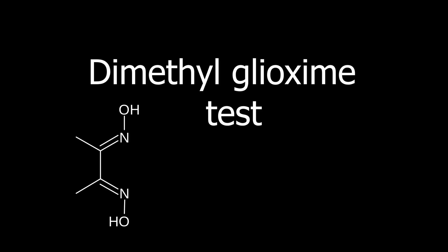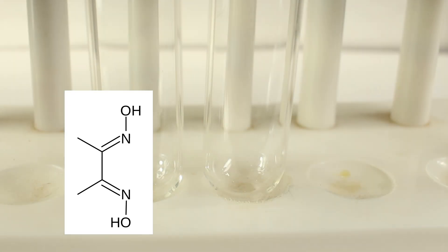Is there a magic bullet which works for nickel and nickel only? Yes, it exists. It's dimethylglyoxime. So let's run the dimethylglyoxime test.